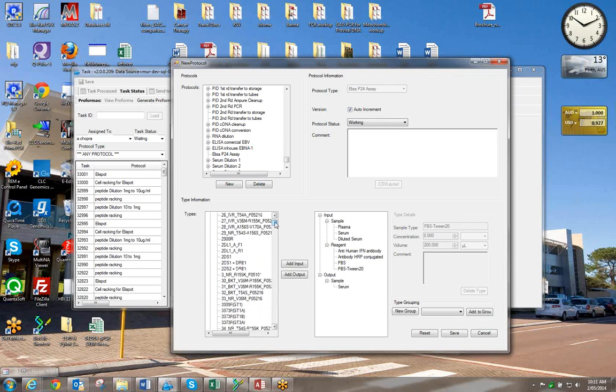Group 1 as a forward primer. I'll just take the example of HIV, to make it easier, or Hep C. Yeah, I remember seeing that the forward and reverse primers are in different groups. That's right. So I'll just show you how to add them in. If I say this becomes my forward primer, and this becomes my reverse primer, you add all the primers once, and then you choose these and make a new group.